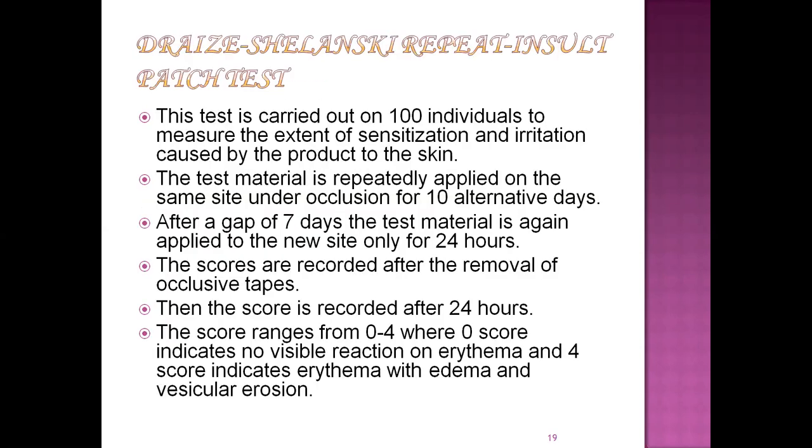Then the Draize-Shelanski repeat patch test. This test is carried out on 100 individuals to measure the extent of sensitization and irritation caused by the product to the skin. The test material is repeatedly applied on the same site under occlusion for 10 alternate days. Then after a gap of 7 days, the test material is again applied to a new site only for 24 hours. Then the scores are recorded after the removal of the test material, after 24 hours. Then the same thing again, 0 to 4, where a score of 0 indicates no visible reaction or erythema, and a score of 4 indicates erythema and edema.